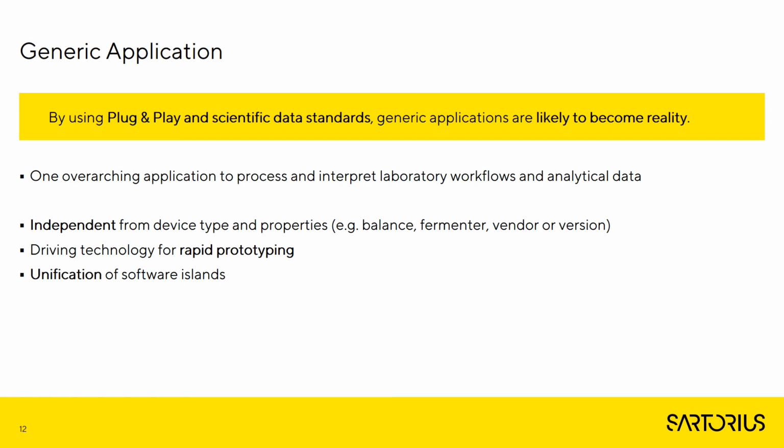For the biopharmaceutical industry, imagine setting up a bioreactor which is capable to directly discover and integrate connected third-party probes and analytical devices. Typically, this integration task takes a lot of effort and know-how and may be minimized by using the introduced concepts. Furthermore, generic applications can be equipped with intuitivity by introducing low-coding technologies like visual programming approaches.